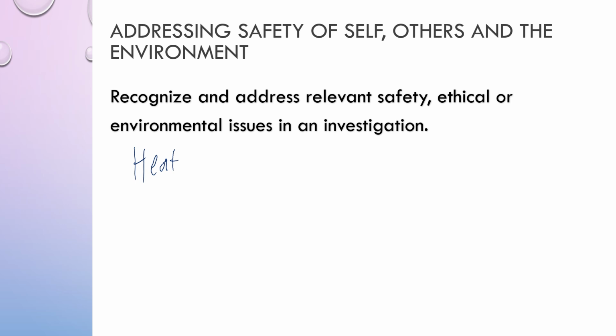Another common one would be spilling anything that might be hazardous or harmful. So I'll put spills. So certain cases it might be more appropriate for you to wear gloves. But other cases, it might be more appropriate to just be very aware of if anything gets on you that you need to wash your hands very quickly.